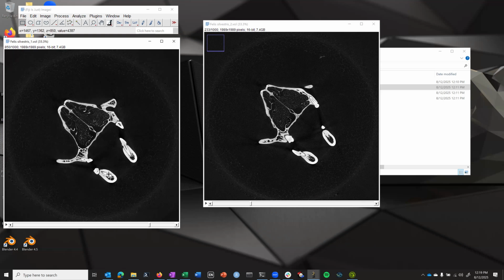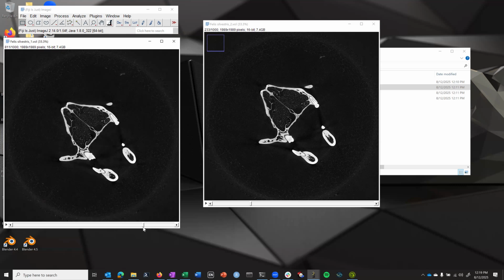We look for a particular feature, like, I'm looking at this tooth here. See if we can find something that's about the right. We're not close yet. Hang on. That's close. Okay, so now we're in the right neighborhood because I look at this feature here and this feature here. I'm trying to zoom in a little bit.